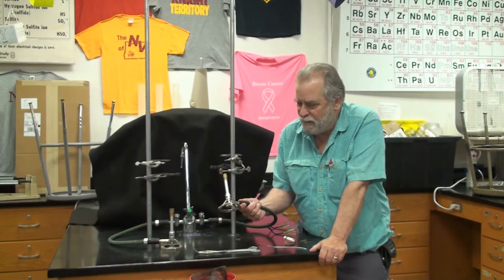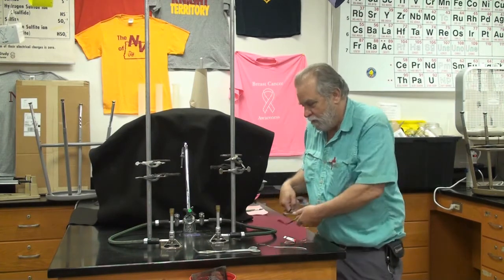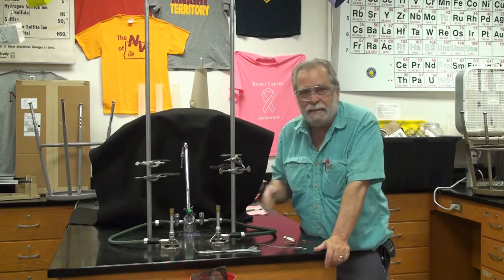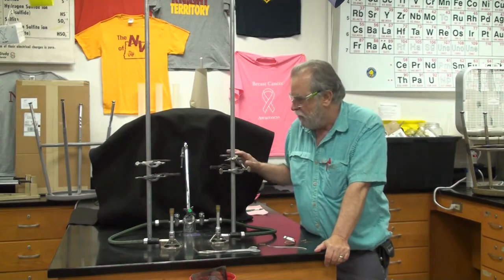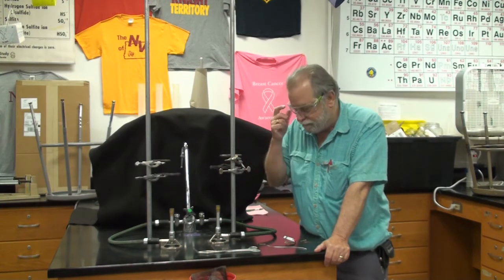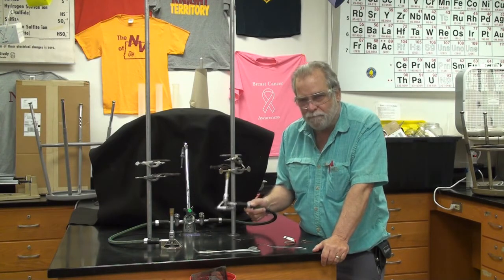The important thing you have to keep in mind for the Bunsen burner is, of course, it's always possible to get burned. We always wear our goggles whenever we're using the Bunsen burner, because every now and then something unexpected happens. Maybe a beaker full of something hot falls off a ring stand or something. But anytime you're over here using the Bunsen burner, you have to wear your goggles. And we'll look at this in depth and see how to adjust it and see what the characteristics of the flame are.